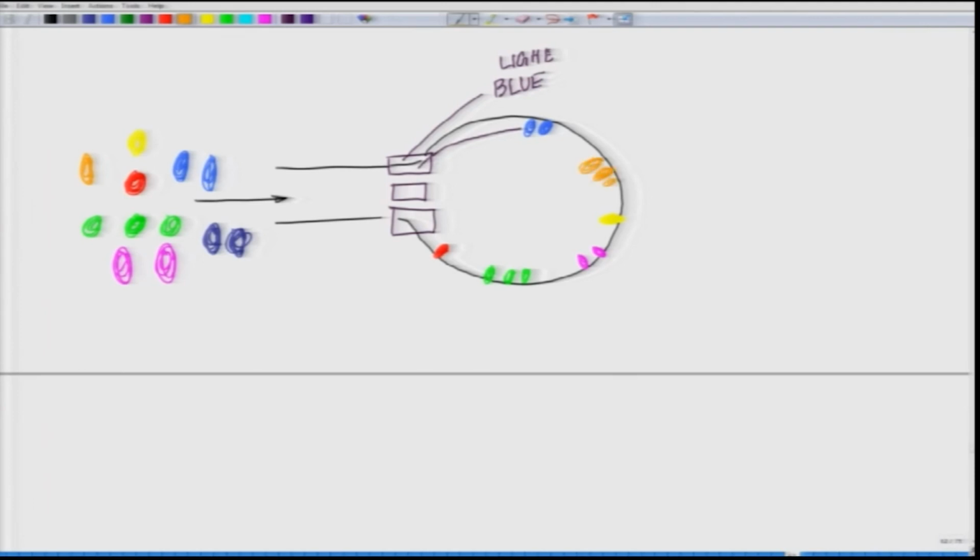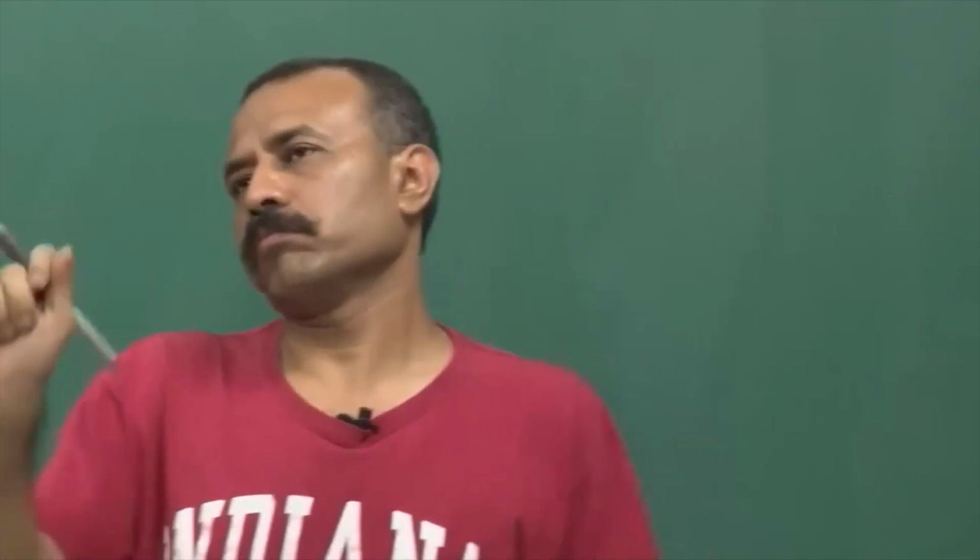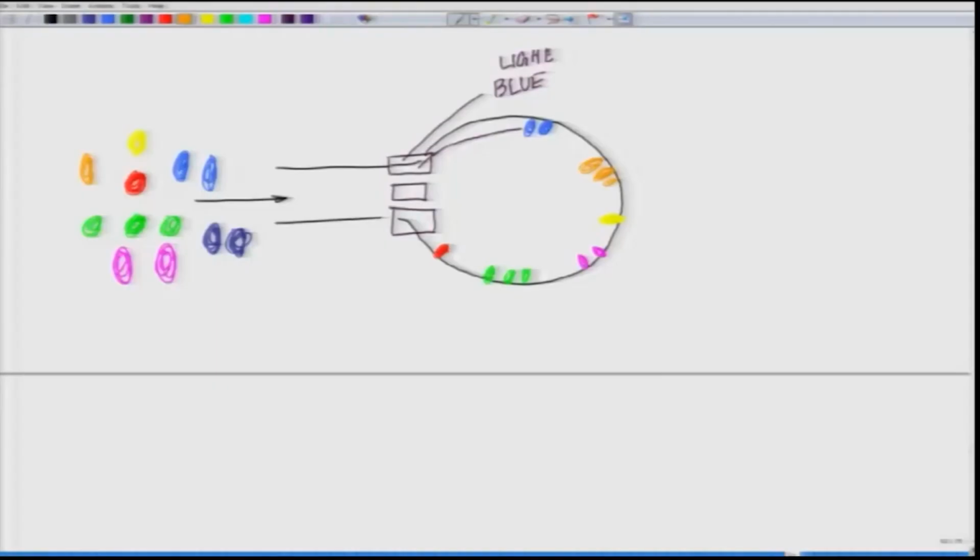So what I wanted to say is, say for example, on the cell surface you have specific markers. If you consider these as different cells, instead they are individuals holding different color tags of tickets. So they have this ticket, I have this color, so okay, for you this place is reserved. For light blue this place is reserved, for light green this is reserved, for pink this is reserved, for yellow this part is reserved, for red this part is reserved. So there are locations which are reserved.